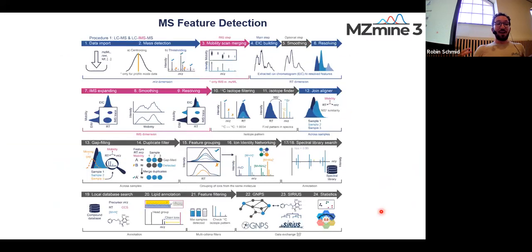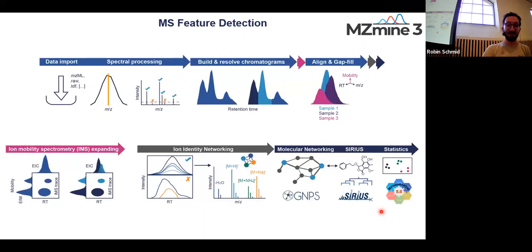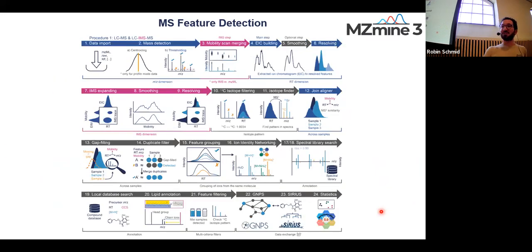And once we have set up the whole pipeline, the other one looked kind of easy still. Now we put together the whole pipeline with all the optional steps and IMS and everything. It might look kind of scary, and we don't have to set up everything today. We're going to take a short track.